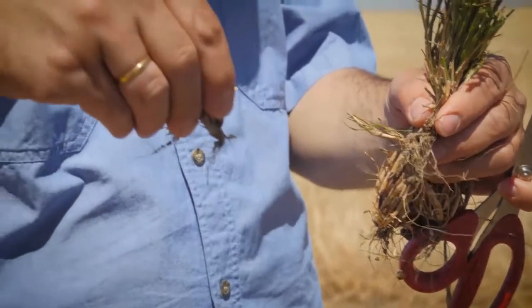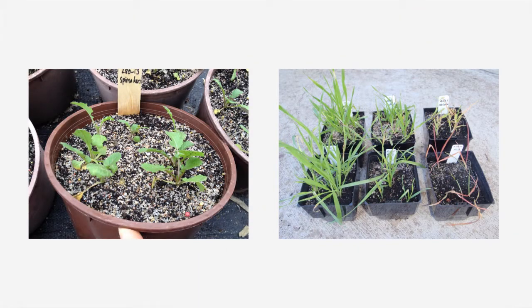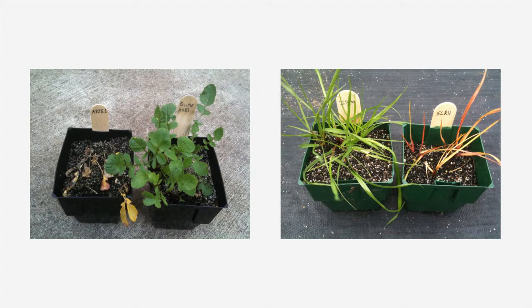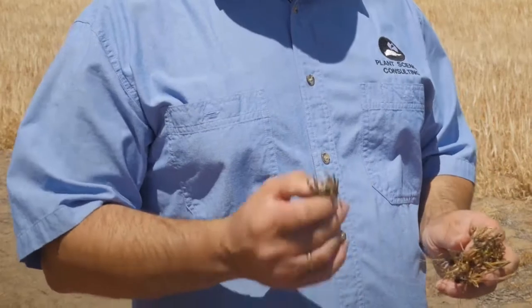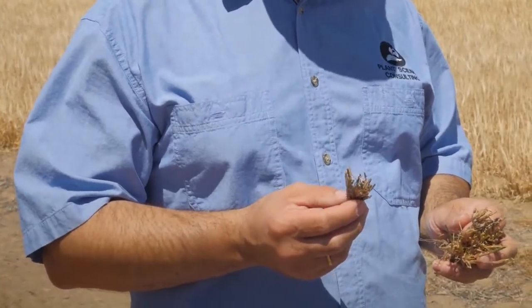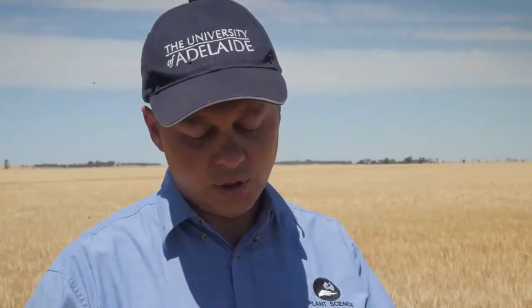They are planted into separate pots, allowed to regrow for 7 days to produce young, actively growing tissue, and then they're sprayed with herbicides in a spray cabinet, which applies a very accurate dose. Even though the plant might be old, it behaves like a young seedling again, and that's why the test is so effective and reliable.